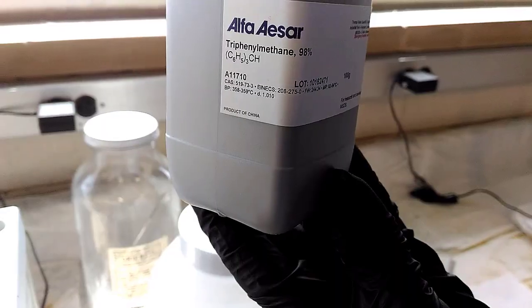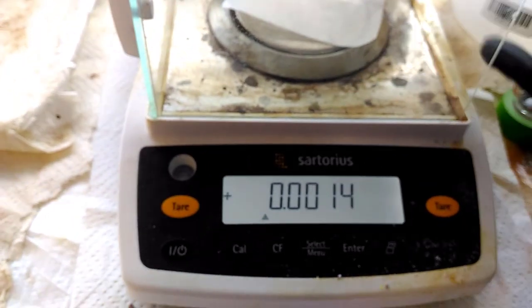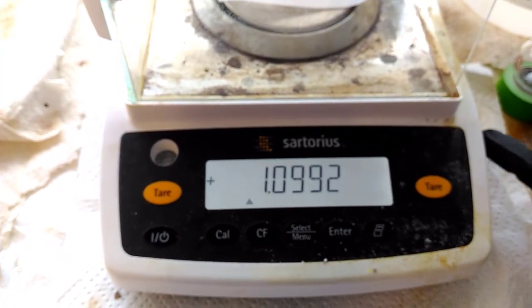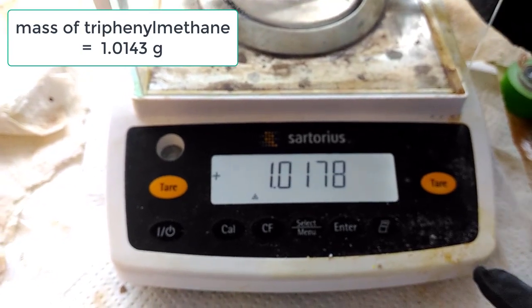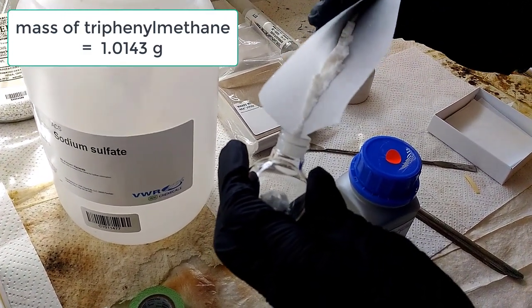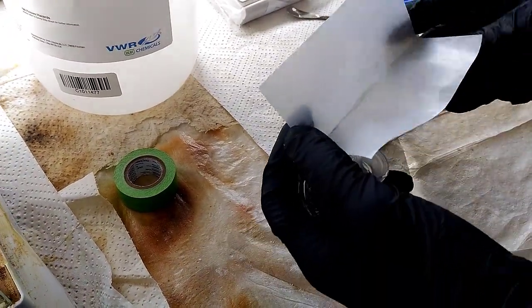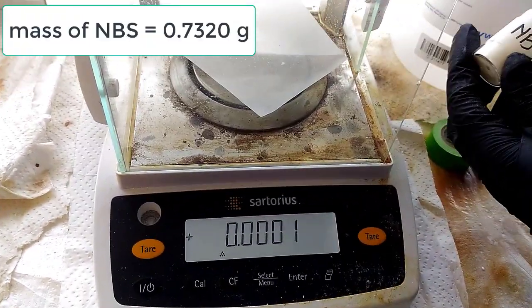They have a round bottom flask and are weighing out a mass of triphenylmethane, our starting reagent. Per the procedure, we want approximately one gram of triphenylmethane. The actual mass used was 1.0143 grams, which is now being added to the round bottom flask.